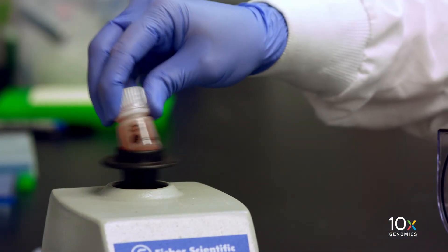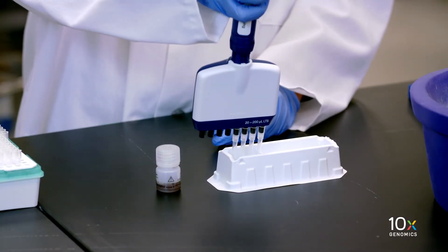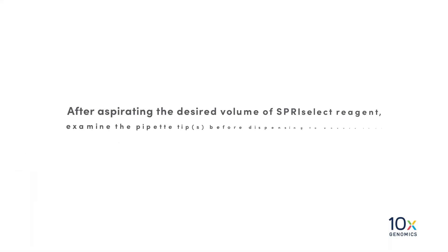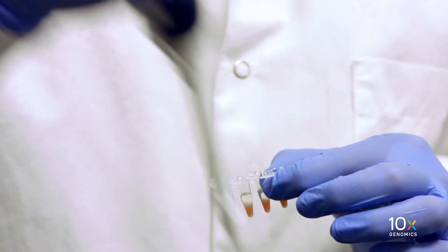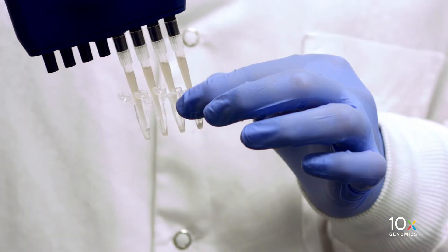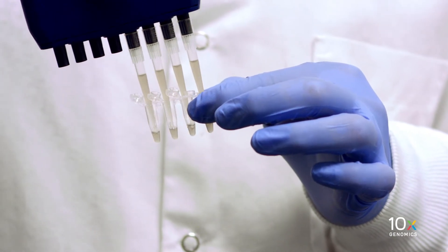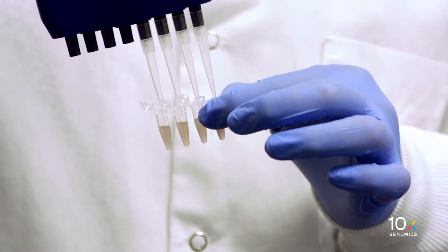First, we vortex the SprySelect reagent until fully resuspended. We aspirate 60 microliters of SprySelect reagent for each sample. After aspirating the desired volume, examine the pipette tips before dispensing to ensure the correct volume is being transferred. Add the SprySelect reagent to each sample in the tube strip and pipette mix 15 times with the pipette set to 150 microliters. Pipette mix thoroughly, as insufficient mixing may lead to inconsistent results.